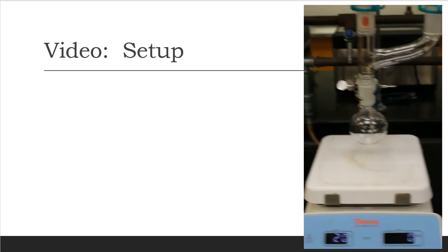All right, so pictures I know don't do you justice, and here I've got a video, and this video is going to show you the glassware setup.